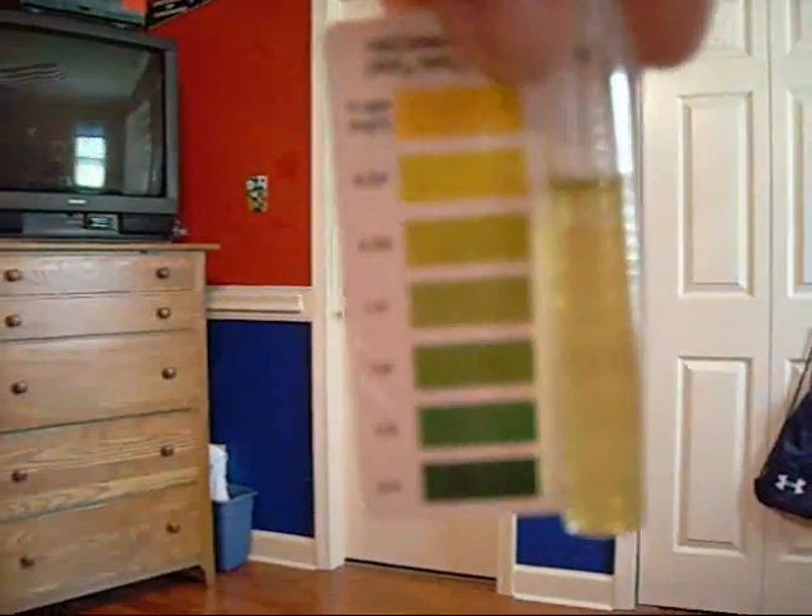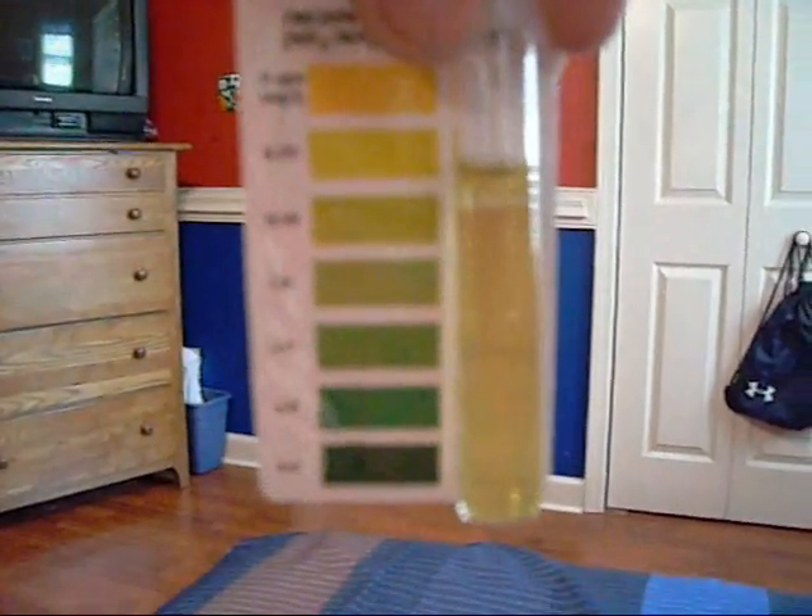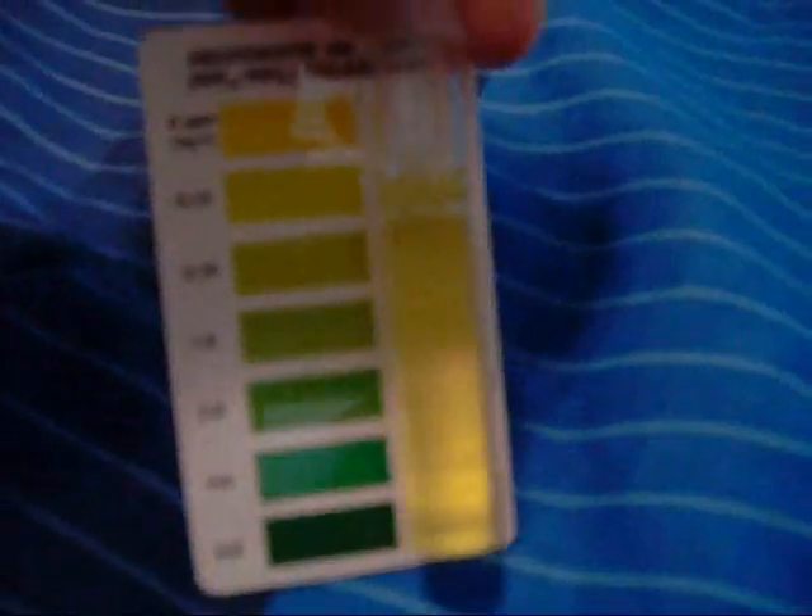Let's compare. So that's about 0, 0.25 — it looks like 0 to me, I can't really tell. That's what it looks like, so I'll take that.